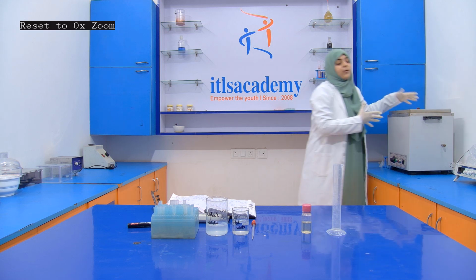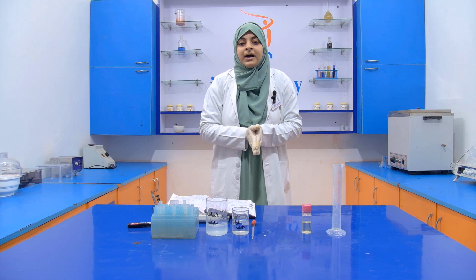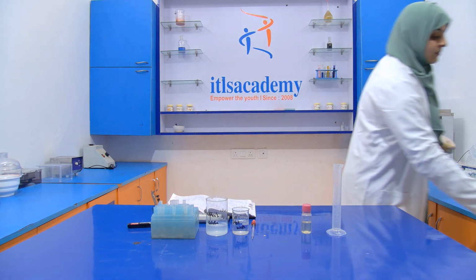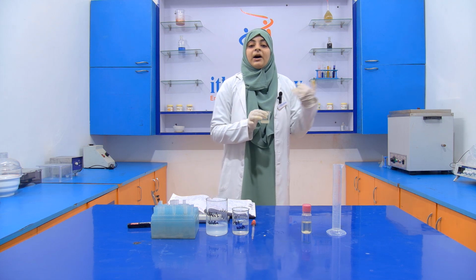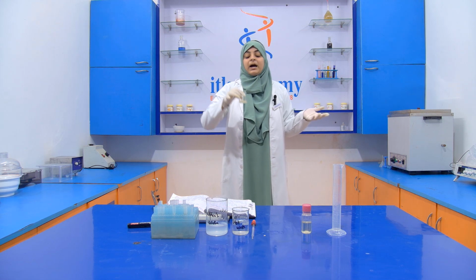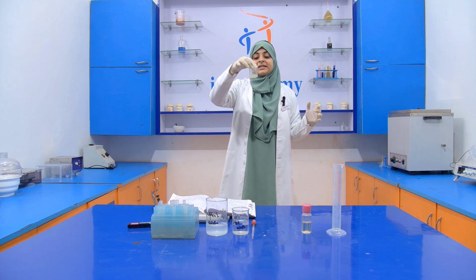After removing from the water bath, I keep it inside the oil bath or a brine bath. Leave it for 2.5 hours, then after that we will see the result.